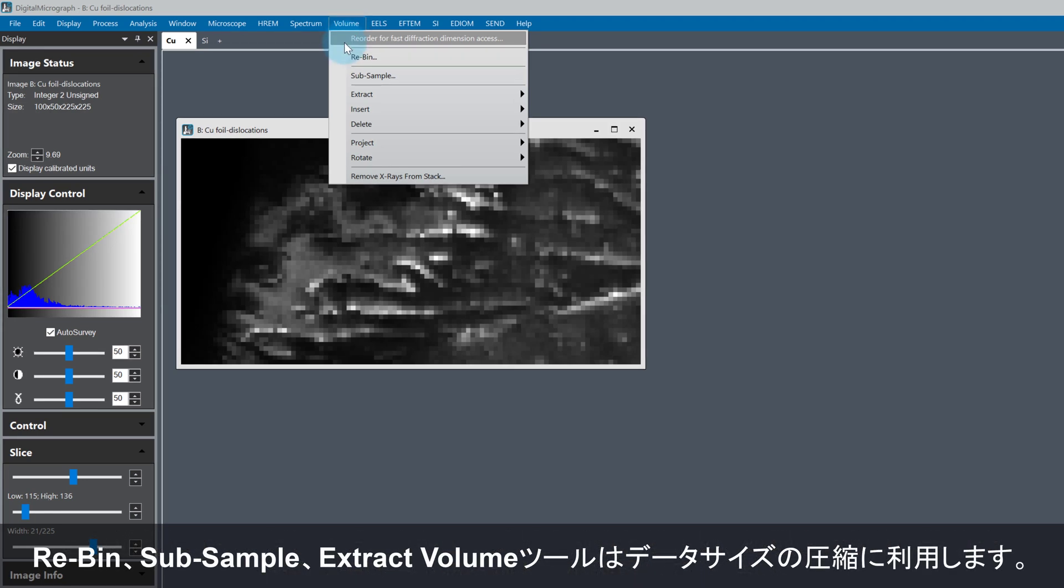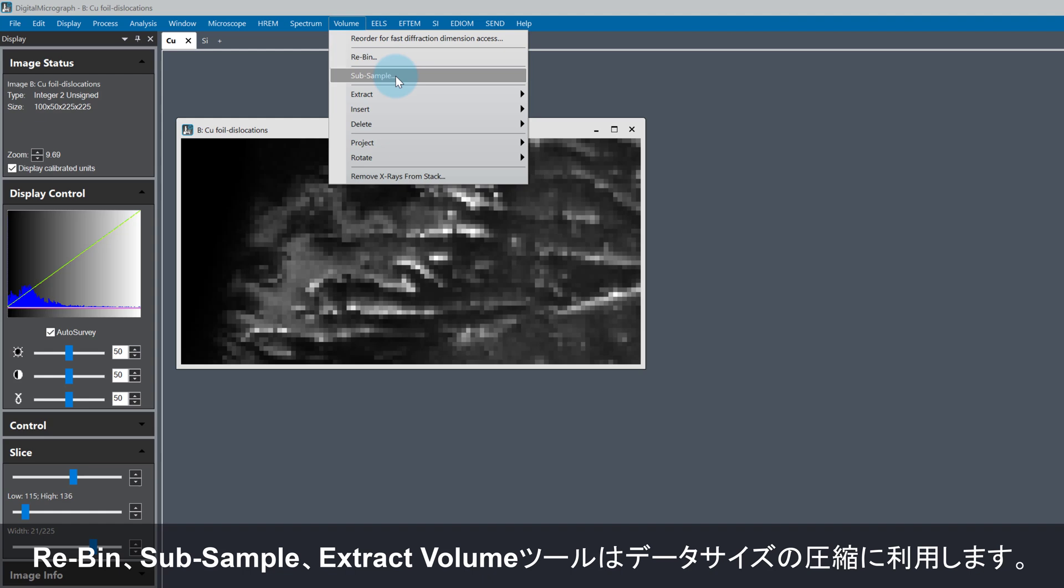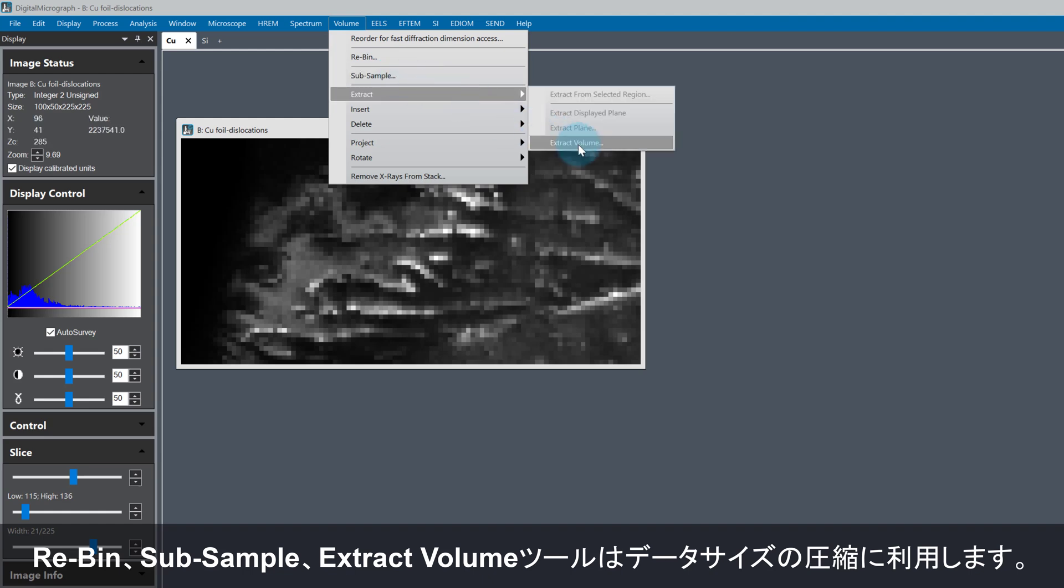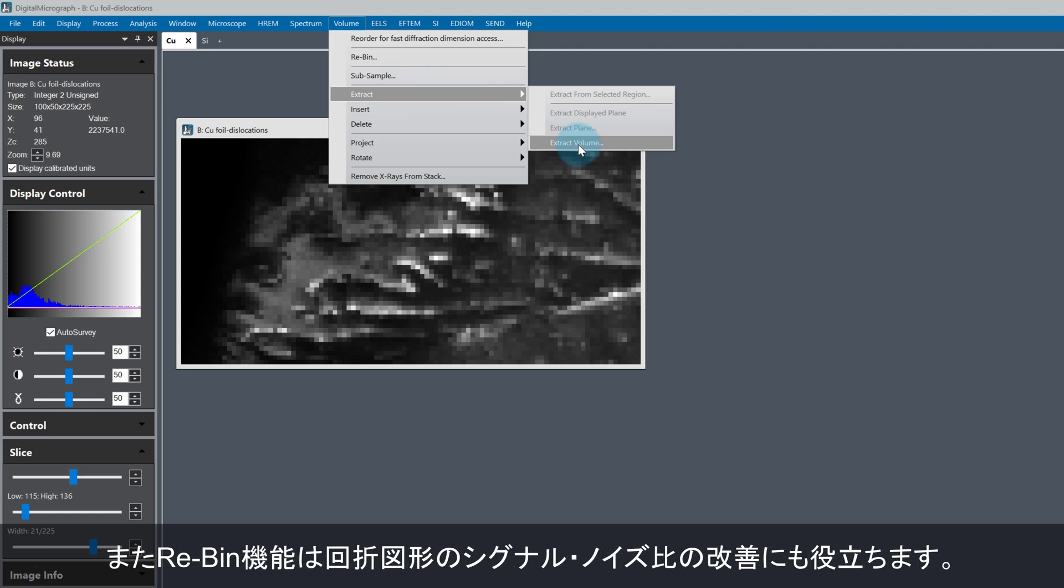Some other useful functions in the volume tools menu are Re-bin, Sub-sample, and Extract Volume. These functions are mainly used to reduce the data size, or in the case of re-binning, improve the signal-to-noise ratio in the diffraction patterns as well as reducing the file size.